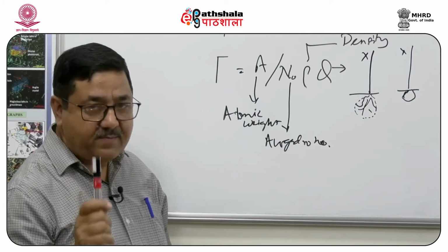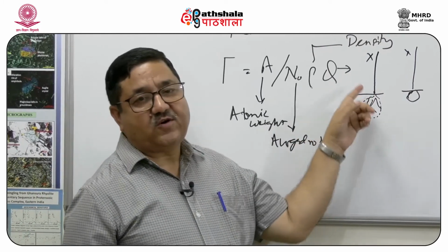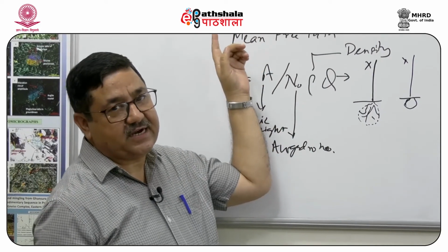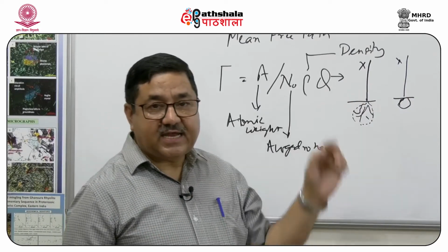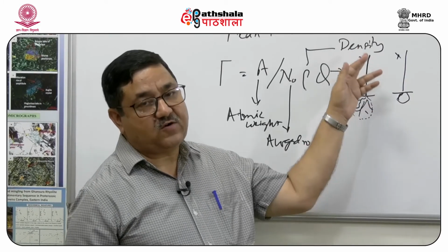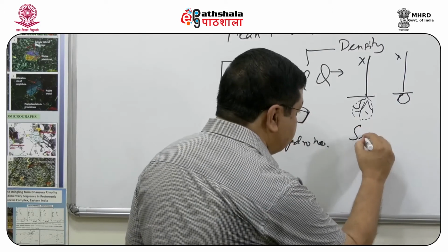We will come to that a little later. So, one category of electrons we talked about are the elastically scattered backscattered electrons, which are a function of the atomic number and are useful as a microscopy function. The other category of electrons which can come out when an electron beam interacts with matter are known as secondary electrons.